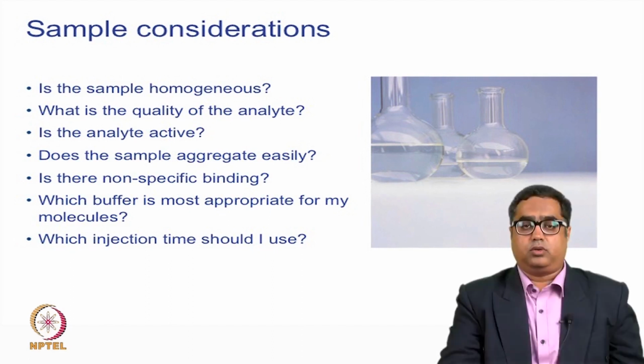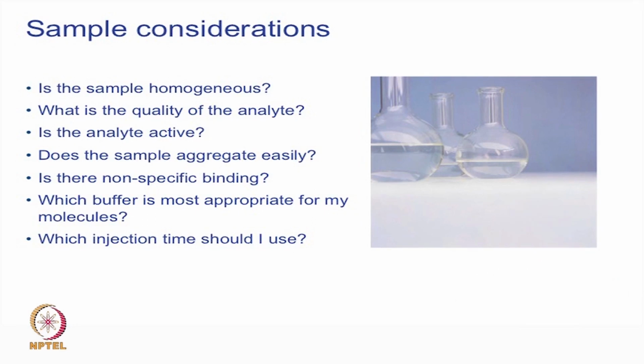And it is very important to understand the right buffer for the right sample. Once we have identified the good sample conditions, then we should think about the association time and the time at which we need to set up our Biacore experiments.